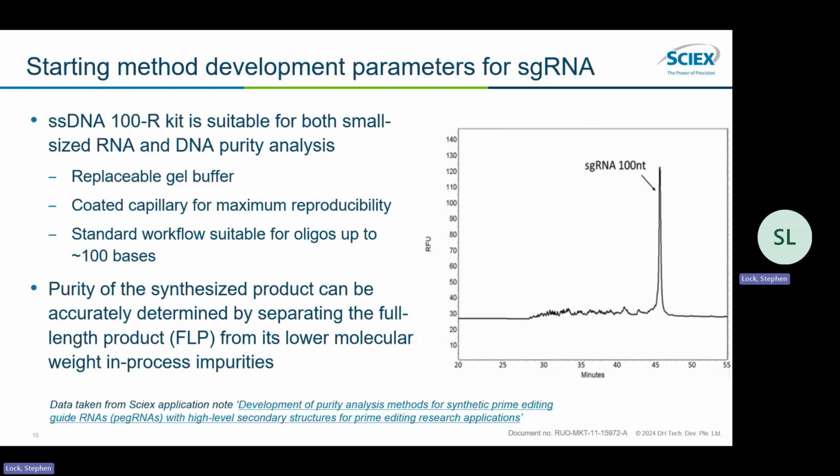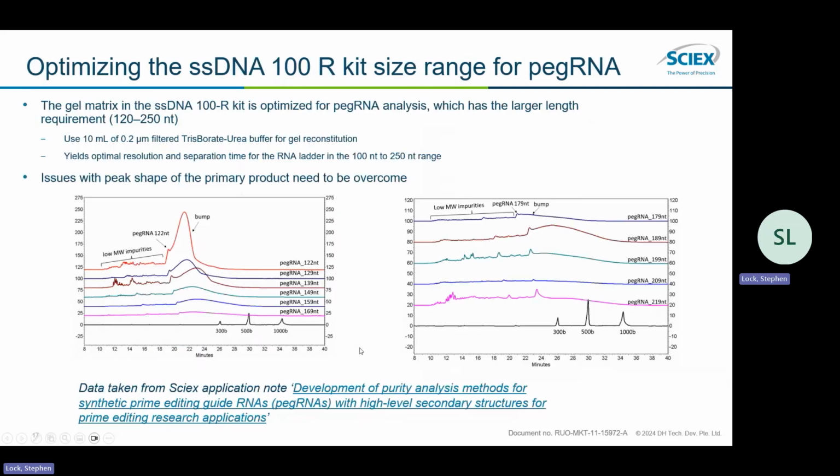Often these oligos are synthesized chemically, and you're able to separate the full length product from its lower molecular weight in-process impurities. And we have a few application notes in this area. If you're interested, I would advise anyone to go to the SCIEX website to look at the application notes for this particular area.